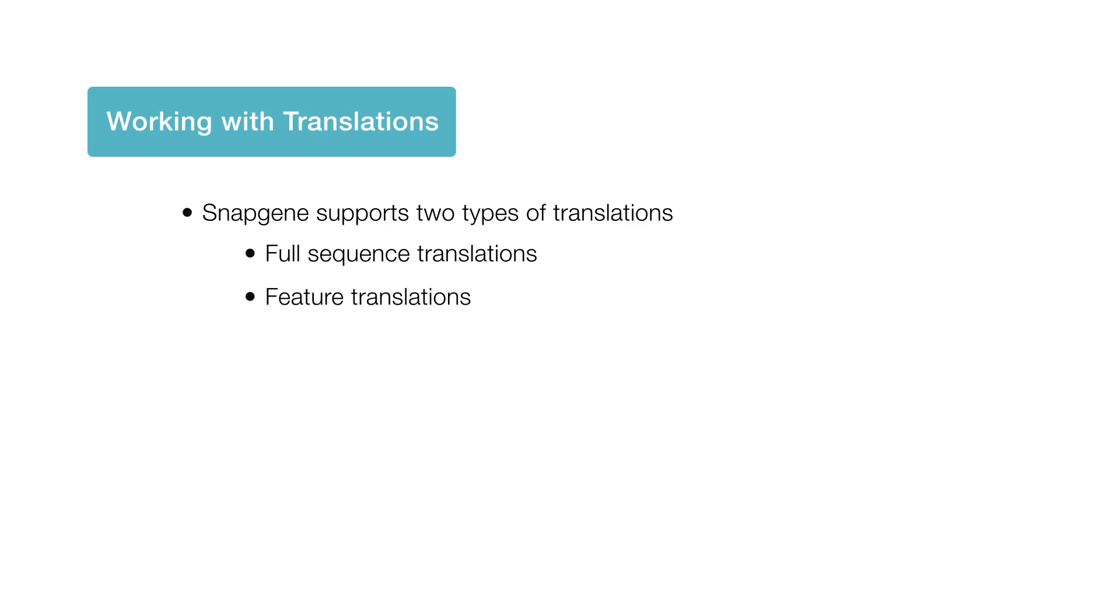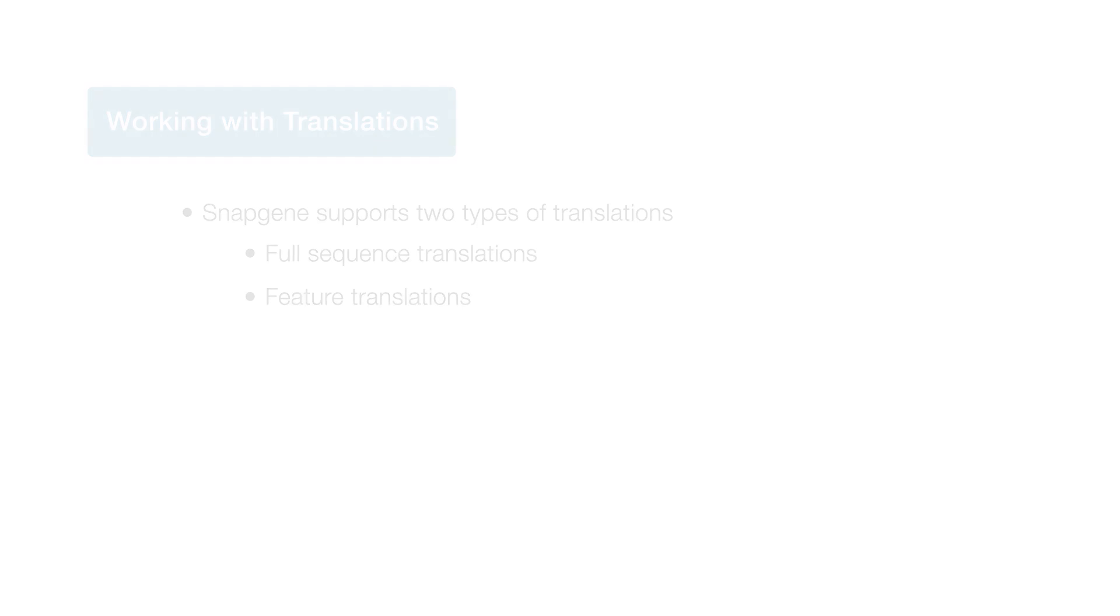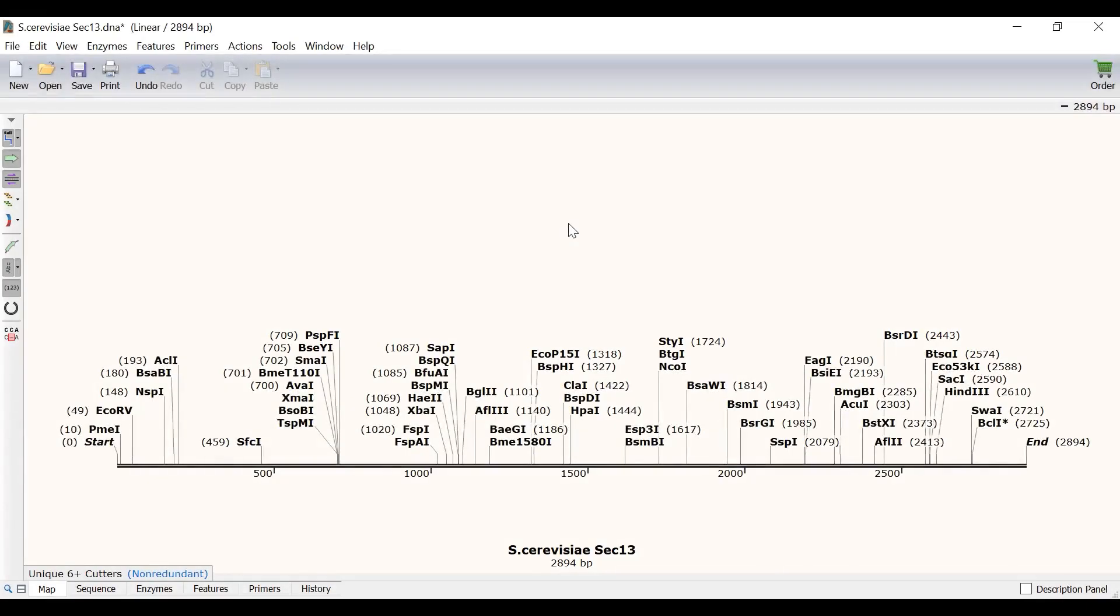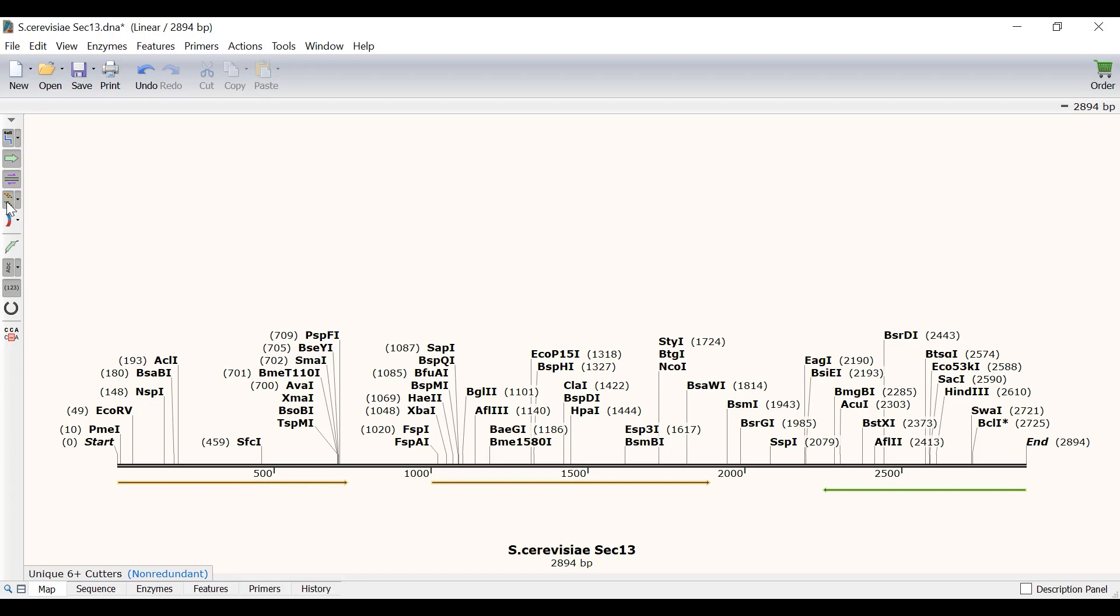I will start with an example of a full sequence translation. Within Snapgene I have a file containing the Saccharomyces sec13 gene with an extra 1 kilobase flanking sequence either side of the gene. To find the sec13 gene within this sequence I will select the show translations button to view the open reading frames.